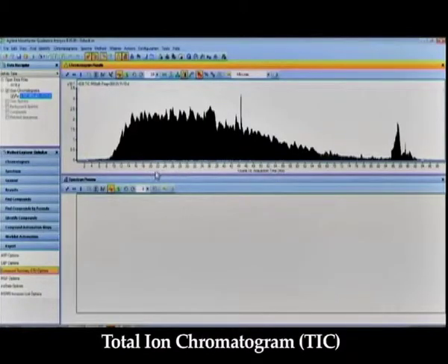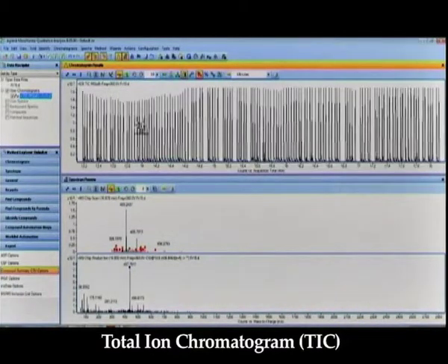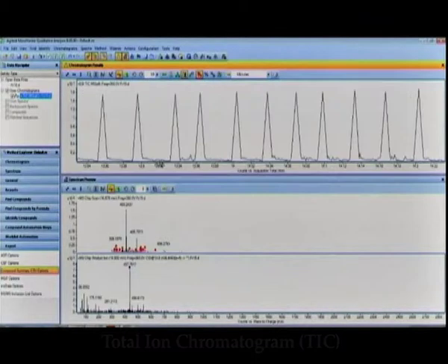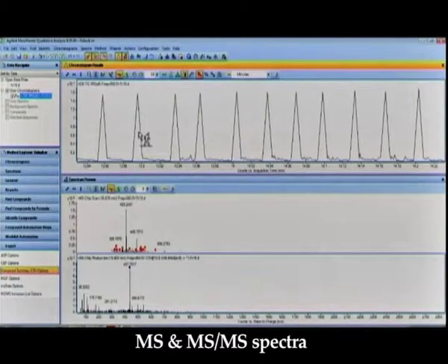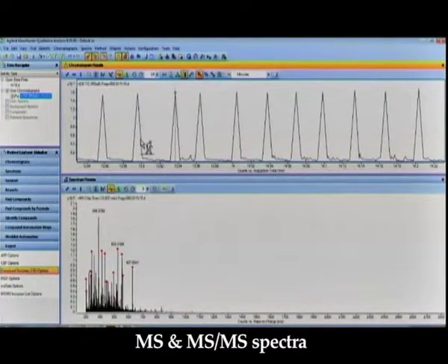The chromatogram shows acquisition time period on the x axis and the intensity of the eluted peptide ions on the y axis. Use right click of the mouse to zoom in on the chromatogram. The bigger peaks which we can see are MS spectra. At the bottom of this window, we can see another window which shows different spectral peaks representing the precursor ions with the red color annotation on top of each peak.